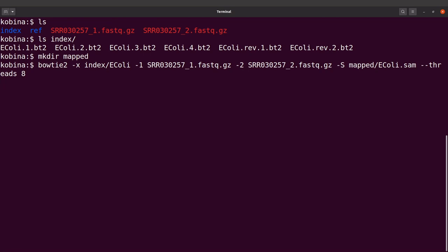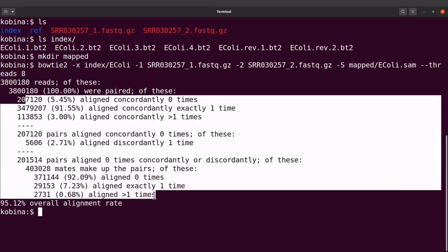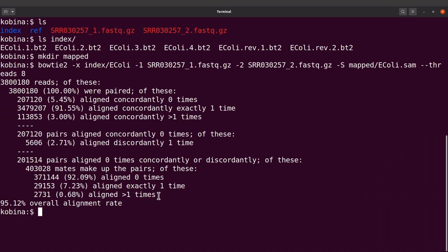Bowtie2 has started the mapping. Mapping is now done. Whenever bowtie2 completes a mapping activity it gives a summary of what happened. We're dealing with paired-end reads, so bowtie2 tells us the percentage of reads that were paired — here it says 100%. The key statistic to focus on is the overall alignment rate: bowtie2 says it's 95.12%, which is high, so things are looking good. Let's explore the output file.